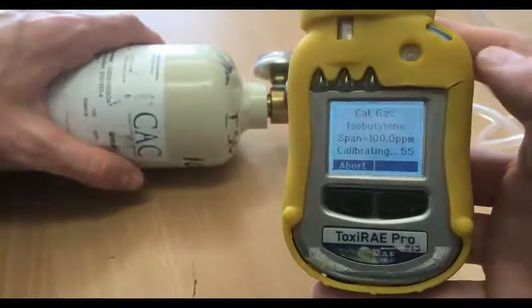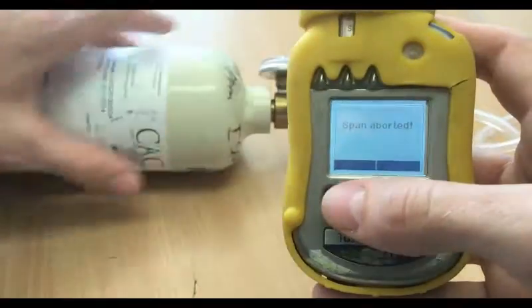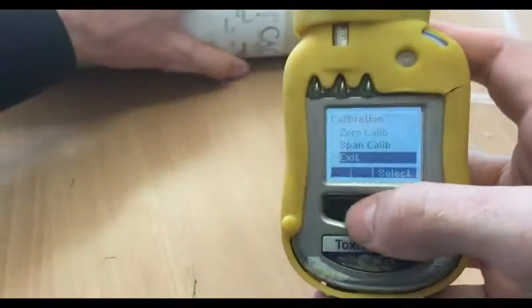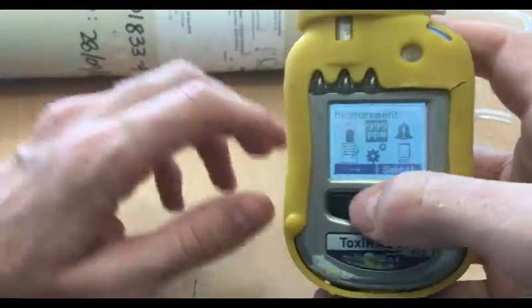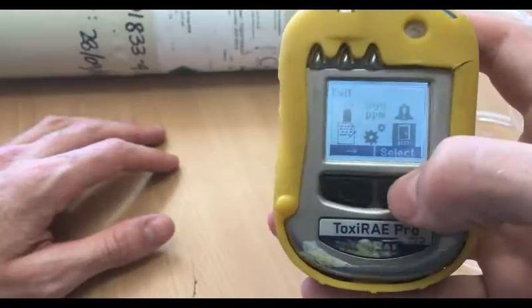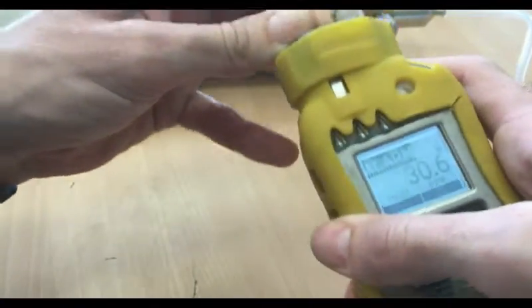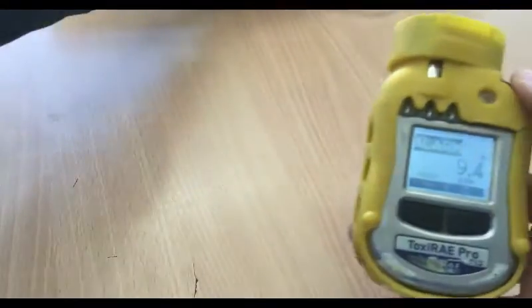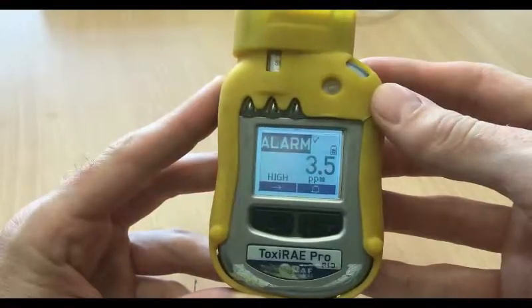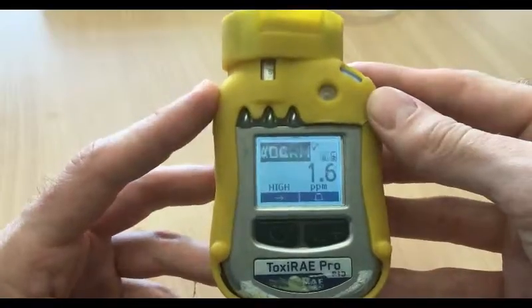Since this unit passed, we're going to exit the calibration menu. Turn off the gas, scroll down to exit, and press select. Make sure you remove your calibration cap and let the unit return to zero, which should happen after a few seconds, and then you're ready to go.